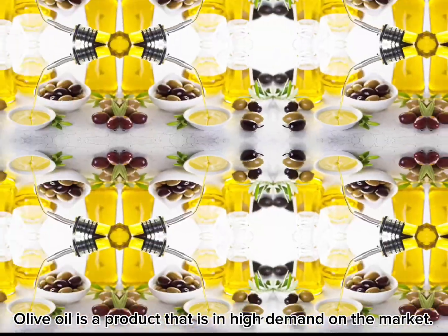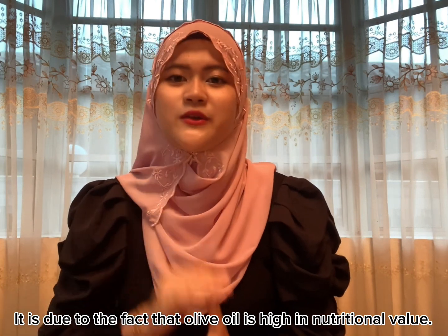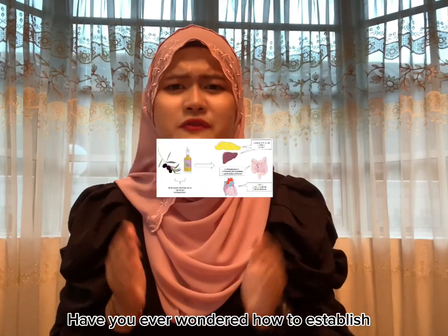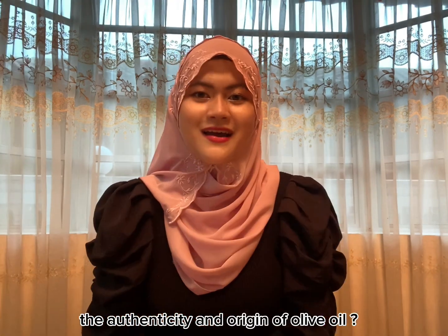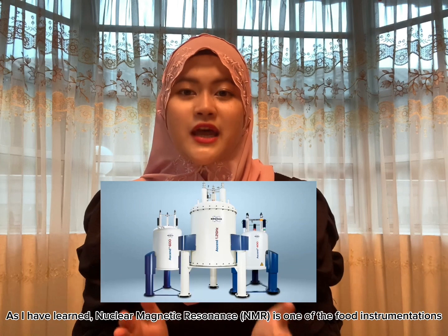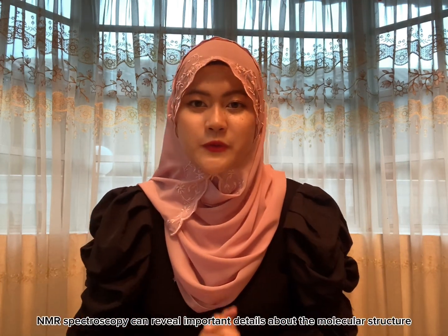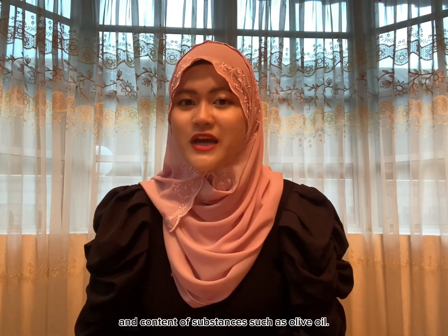Olive oil is a product that is in high demand on the market. It is due to the fact that olive oil is high in nutritional value and antioxidant qualities such as polyphenols, which protect blood lipids from oxidative stress. Have you ever wondered how to establish the authenticity and origin of olive oil? As I have learned, nuclear magnetic resonance (NMR) is one of the food instrumentation techniques that can be used to determine the authenticity and origin of a food product by examining its chemical composition. NMR spectroscopy can reveal important details about the molecular structure and content of a substance, such as olive oil.